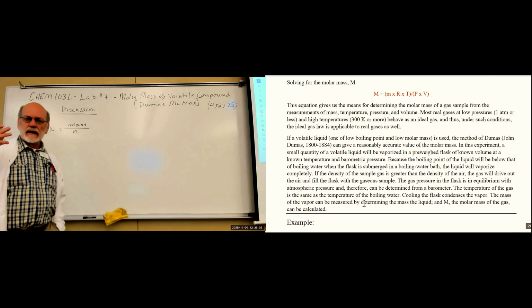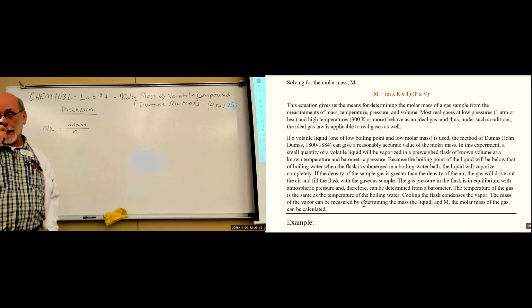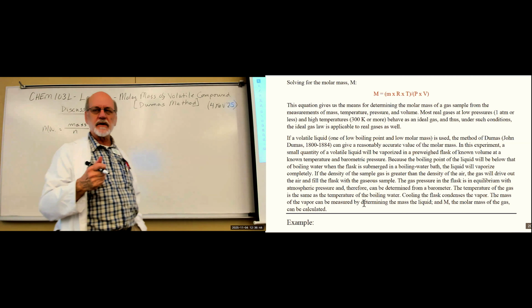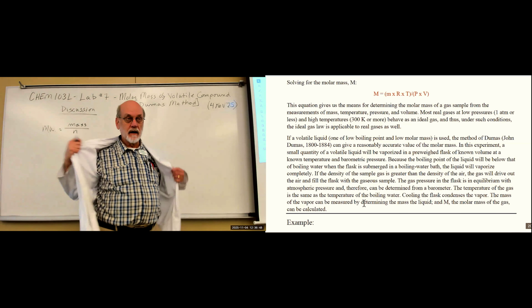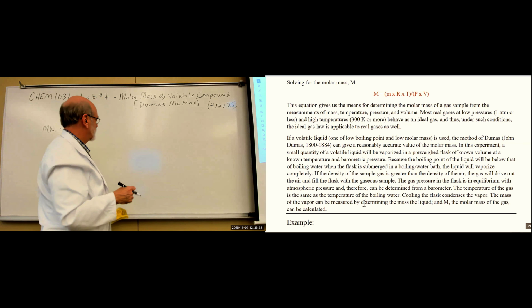Okay. So how are we going to get the mass of a gas? Believe it or not, you can. If your balances are accurate enough, if your volume is large enough, you can get an accurate measure of the mass of a gas.